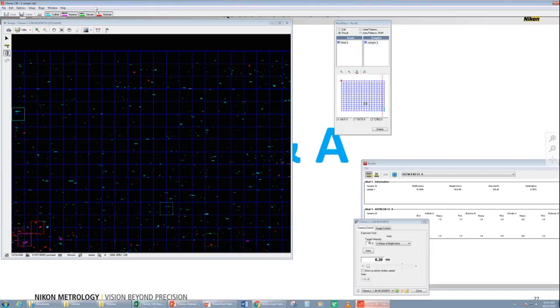We also do ASTM E2283, which is the extreme value inclusion. That's used to find the largest potential inclusion calculated using statistics. We also use EN 10247. In this case you need a color camera, and it's for the worst field section.